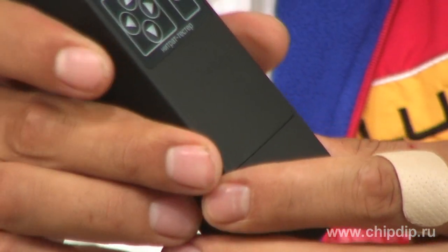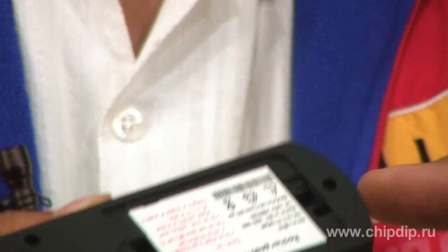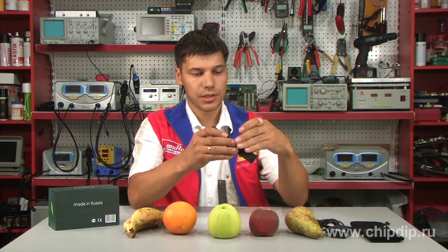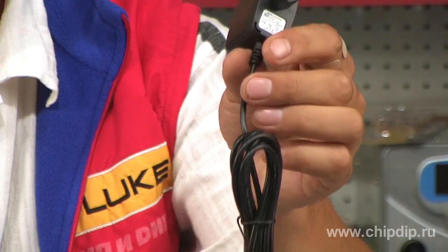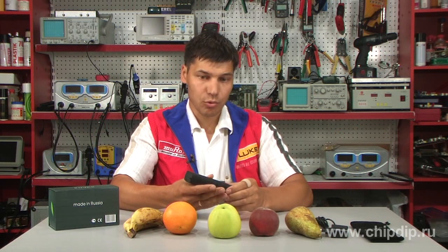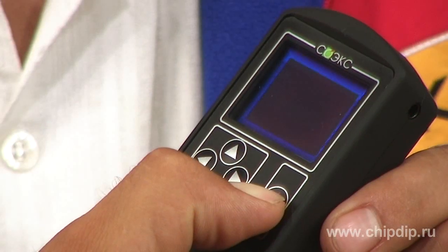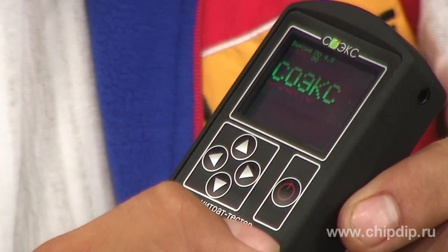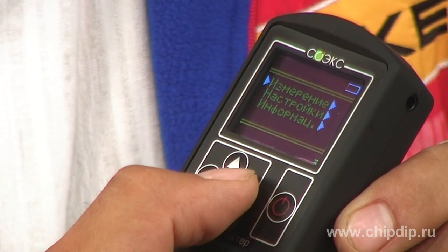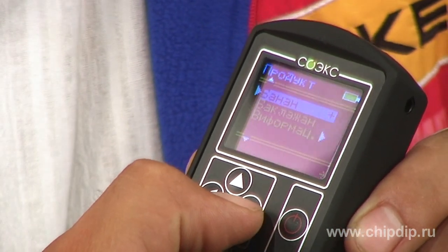It is supplied from a battery that can be charged by the supplied charger. Press the button on the tester to turn it on. In the open window, select the item Measurement, then choose the testing product from the list.